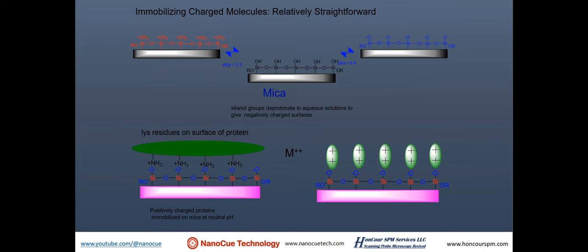I will not go into too much detail on this topic because I already covered it in a previous presentation. You can go to the YouTube channel, where there are recordings with more details on immobilization. Basically, your sample has to be fixed on the substrate. We either use electrostatic force or a covalent bond.